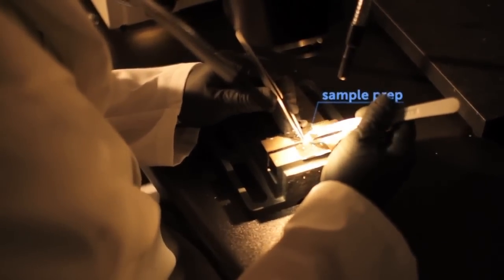One company thinks that the specialty coating another company is selling is identical to their own because that other company was in fact started by a previous employee who had been dismissed. To determine if that in fact was true, Polymer Solutions used two analytical methods to evaluate the two coatings.